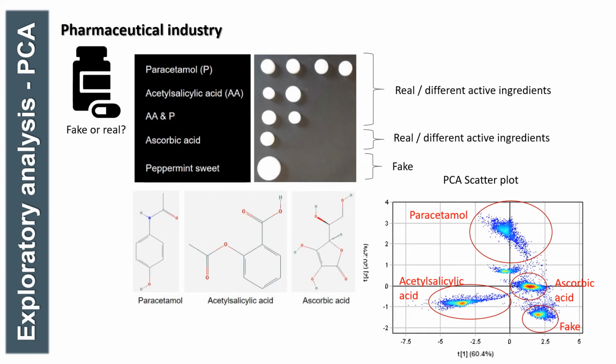Exploratory analysis therefore allows us to compare the chemistry of samples and to investigate if the chemical differences result in meaningful information or applications.